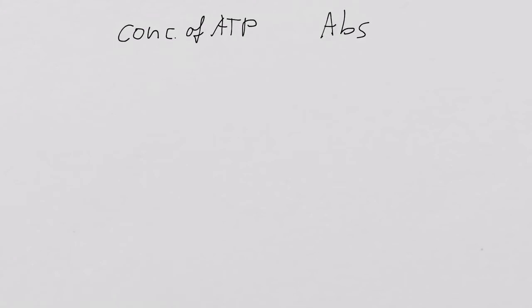So, for example, we use a solution in the first place where we have no ATP in it. So no ATP. What would you expect is the absorbance of a solution that has no ATP in it? 100? What 100? Why 100? Is there anything in it that would absorb the light? No. So if there's nothing in it, the absorbance should be 0, shouldn't it? Make sense? You were thinking the other way around. You were thinking in transmission. Valid point. But the absorbance in this case would be 0.